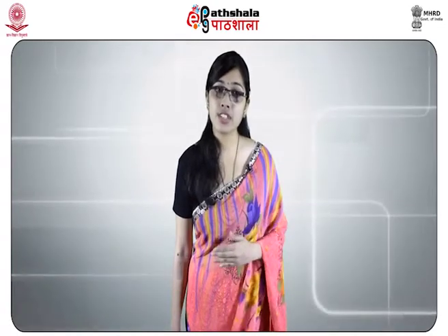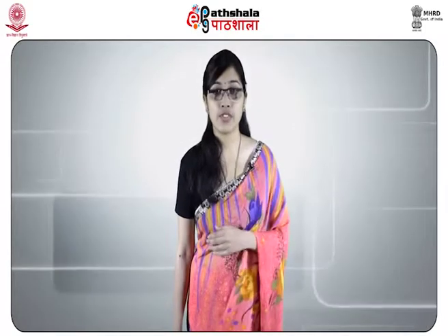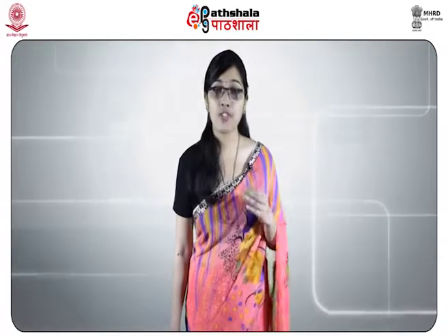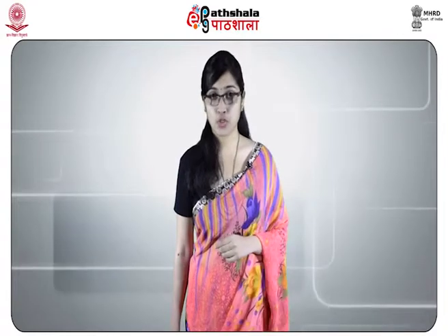Hair evidence as corroborative evidence is available in most serious crime scenes, especially in offences against the person. The first examination is to check whether the hair belongs to a human or an animal. If it belongs to an animal, then which animal it belongs to.